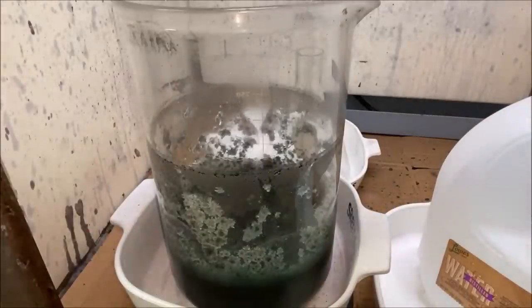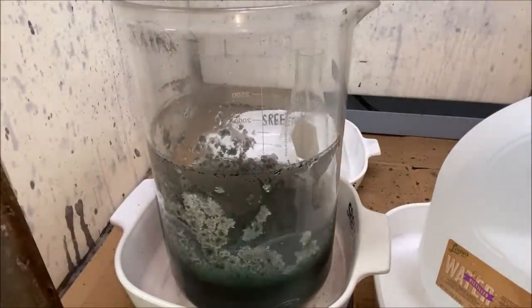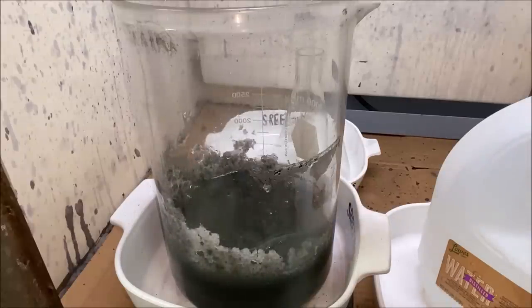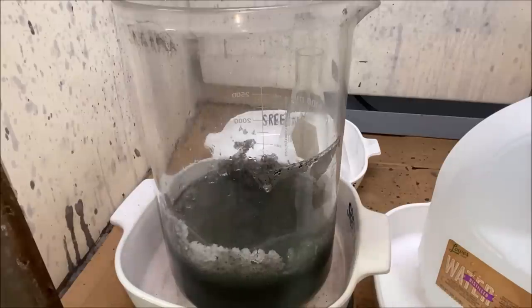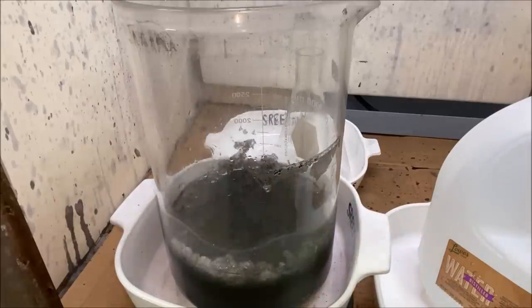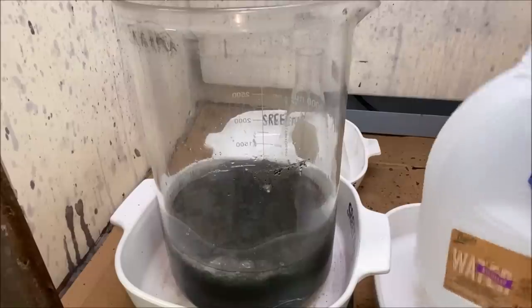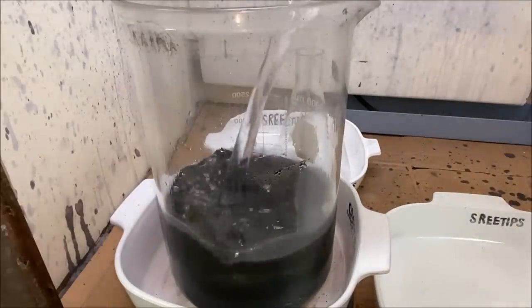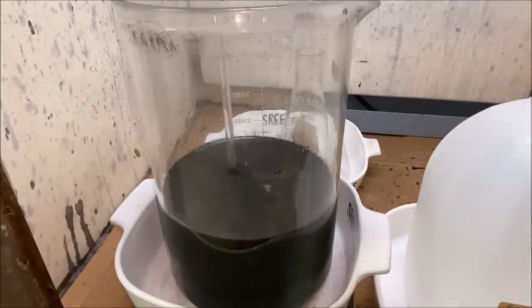Here we go. Let's wash some of this stuff down off the inside of the beaker. Should just be some silver nitrate crystals. They should dissolve easily with distilled water. Add some more distilled water. Stir this up real good.